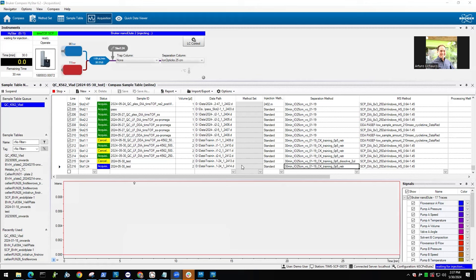So we have our autosampler arm, and we have our autosampler drawer. We can freely configure what kind of plates or vial trays we want to use. Well, freely is an overstatement. So you have three settings for either 384 or 96 well plates. You can't go higher.